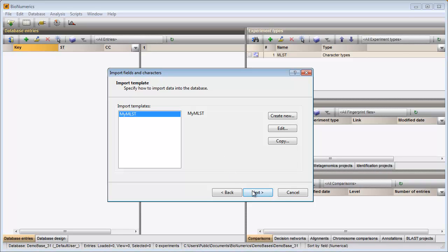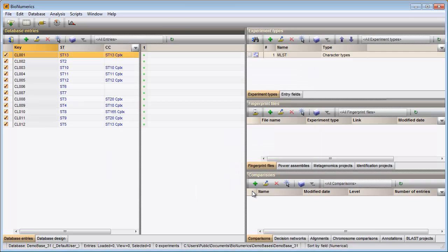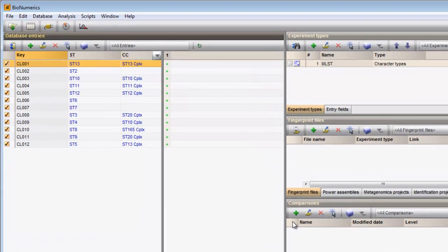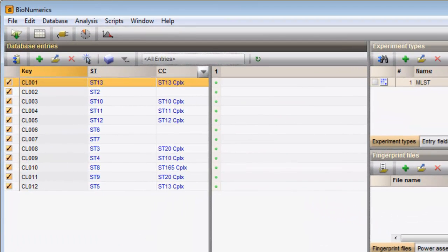I make sure the template is selected and press Next to go to the final step. Pressing the Finish button starts the import. The imported entry information is displayed in the Database Entries panel.